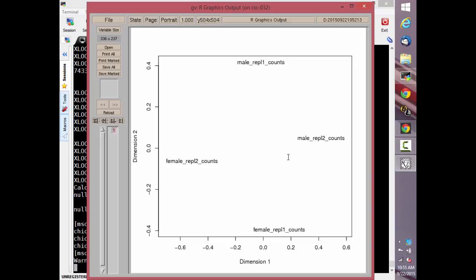Were all of these, the list goes on and on as to what could have caused separation between these. This MDS plot is vitally important, however, when you have an adequate number of samples, especially if you're concerned about the possibility of batch effect. Batch effect doesn't always have to mean same sample or same individual. It could be something as simple as what day these samples were gathered on, or what time point.